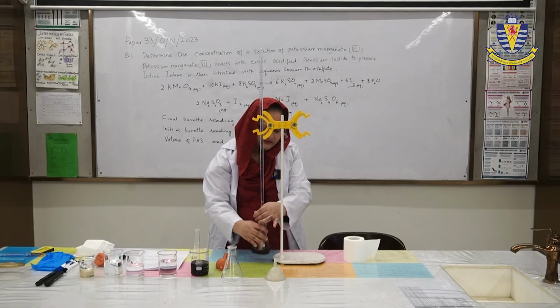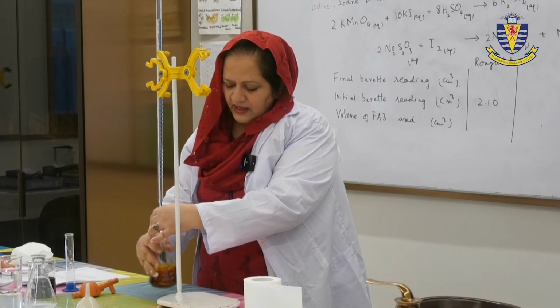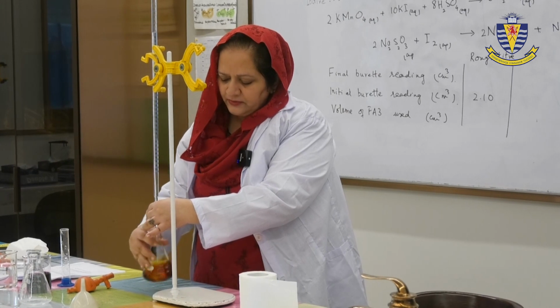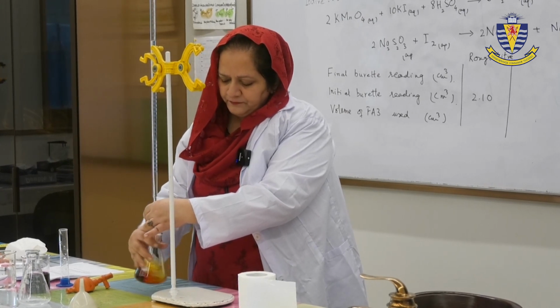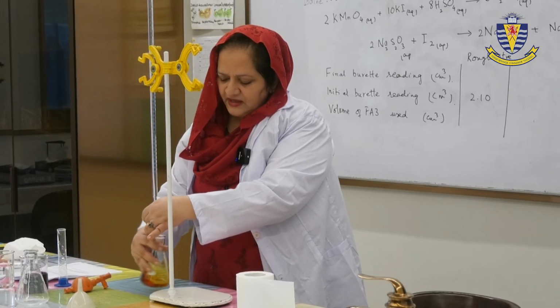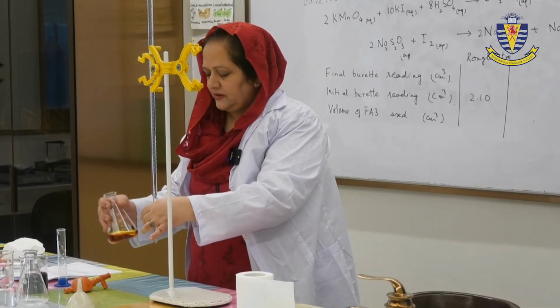Keep an eye on the solution and keep on adding till the solution becomes yellow. That is when the reddish tinge of the iodine has disappeared.